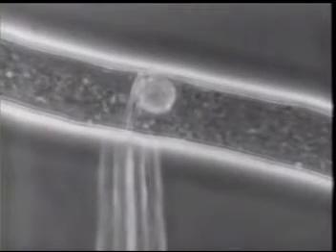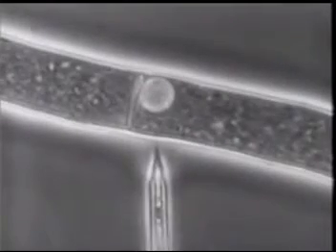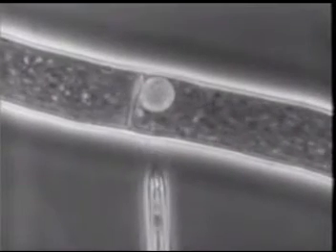The cell wall shows the bright objects on the far side of the hyphae are cholesterol, or rather, correction, ergosterol crystals.